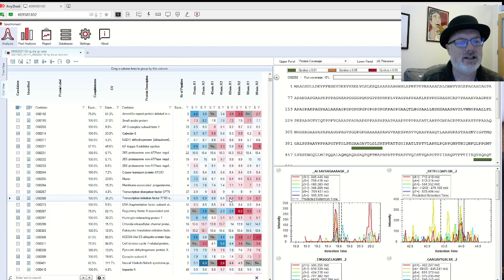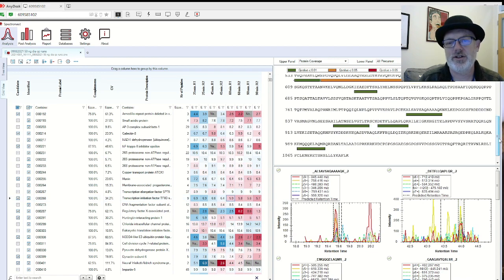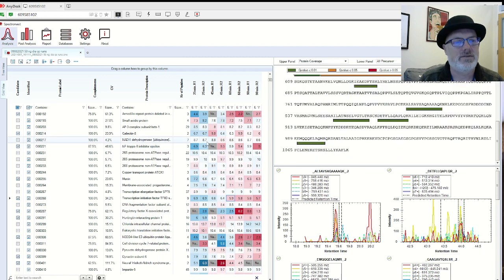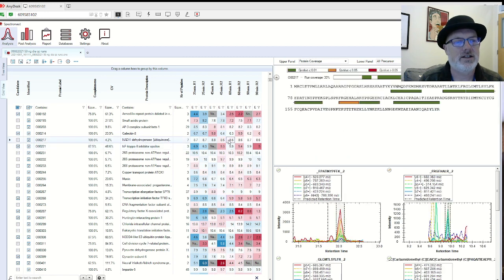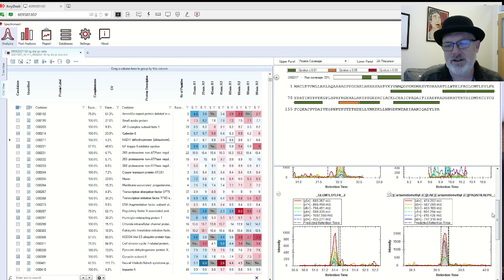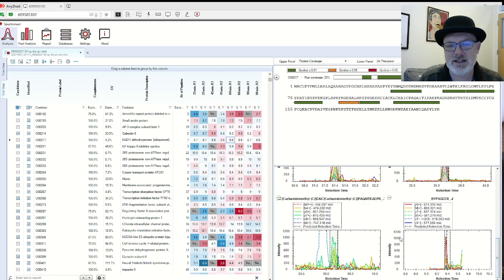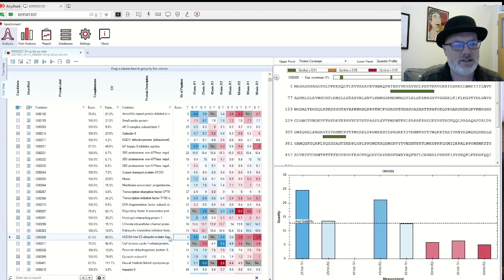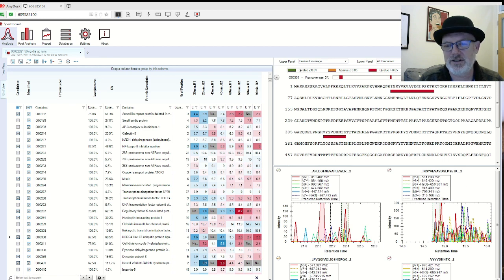Okay, and remember we can click on these and look at the data. It will now show you things that are not very good and things that are. Look at this one, look at the data. You can kind of get an idea of what looks better. Like, look at that. Isn't that beautiful? It's beautiful. So some things I think will get less crappy looking data because we're not doing imputation anymore, but still we see some that are borderline.